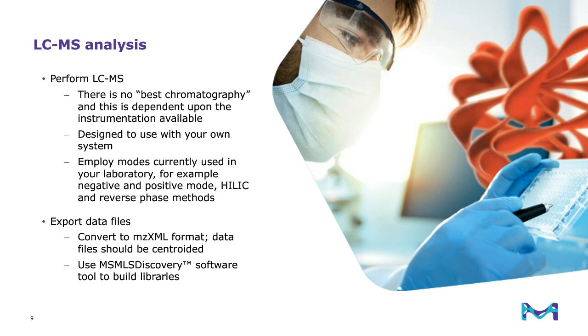So there's no best chromatography, and of course this is dependent upon the instrumentation available. There's no single recommended mass spec model or protocol. The library was designed to help you tailor your own system and support your ability to build a library using authentic compounds under the source and chromatographic conditions available in each laboratory.